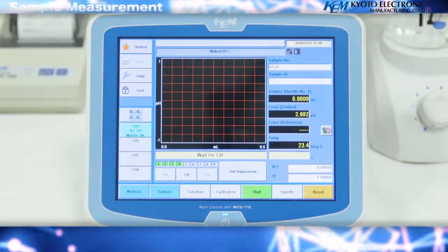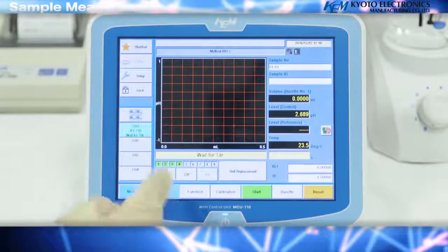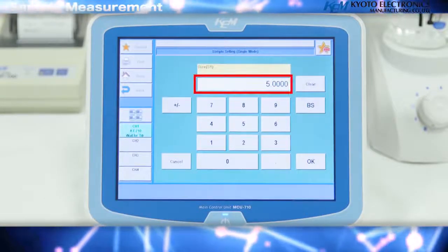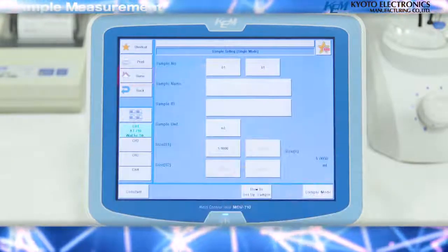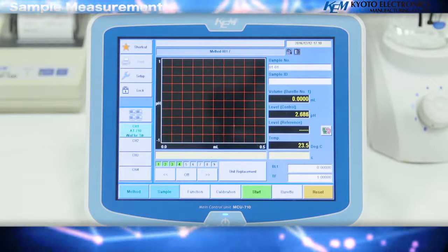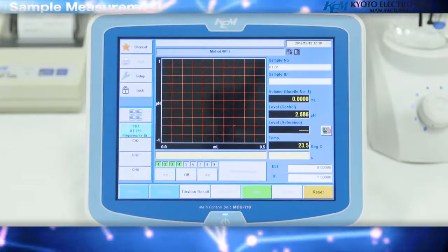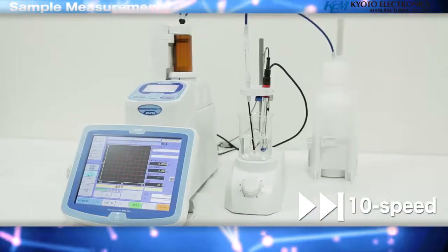Sample measurement: let's start by taking a sample. Press the sample key, followed by the size S1 key. This time we will take 5 milliliters of the sample, so enter 5 mL and press the OK key. You can return to the home screen with the home key and confirm that 'wait for titration' is displayed. Begin titration with the start key. Titration preparation will be displayed and the measurement process will begin.